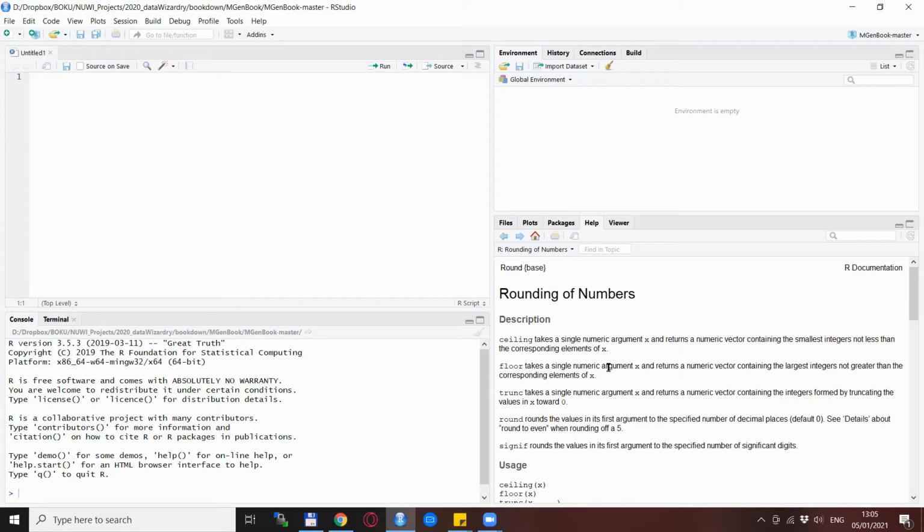So let's start with the first command, and that is installing some packages, because R comes with a number of so-called base packages that are already installed, but if you want to use some specialties, then you need to install them yourself. The command for installing packages is install.packages, and when you start to type, it already appears on the screen.